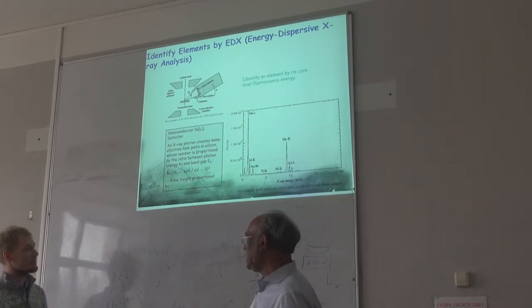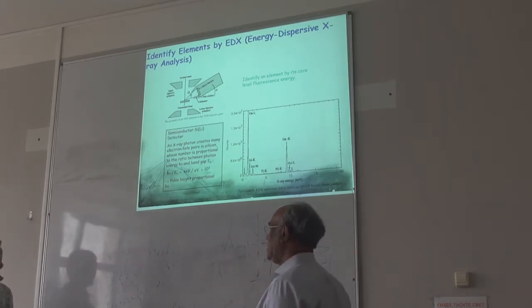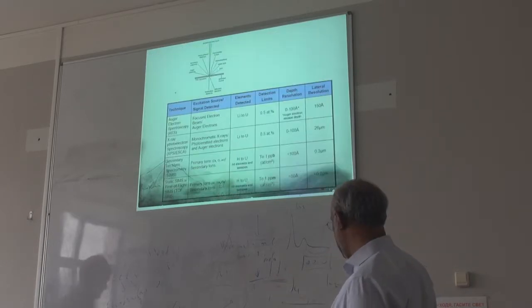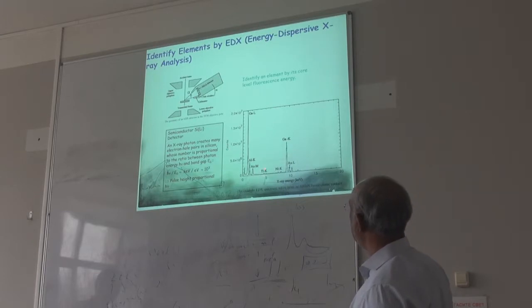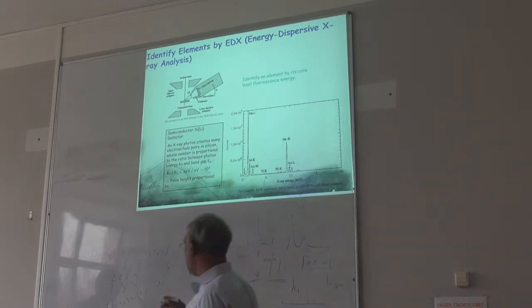That's X-ray. So in EDAX you are looking at the X-ray spectrum. From that we know the corresponding energy, and you can easily tell whether this is aluminum or gallium or titanium, nickel. Every element you can easily see from this. This is a very easy technique. Sometimes we call it the elemental mapping technique.